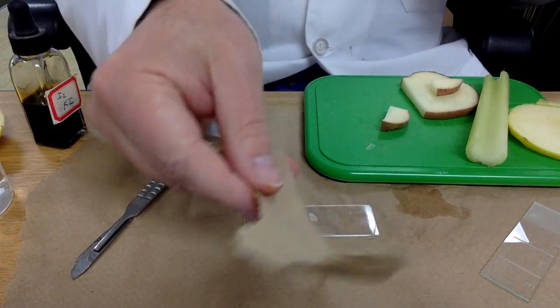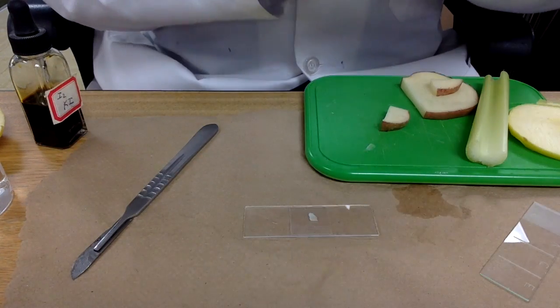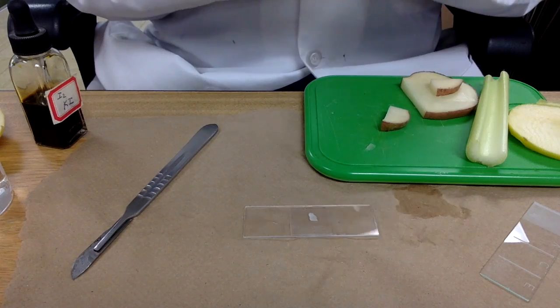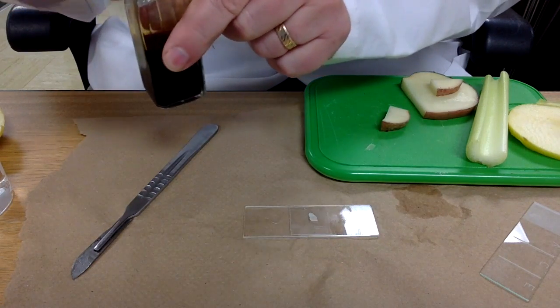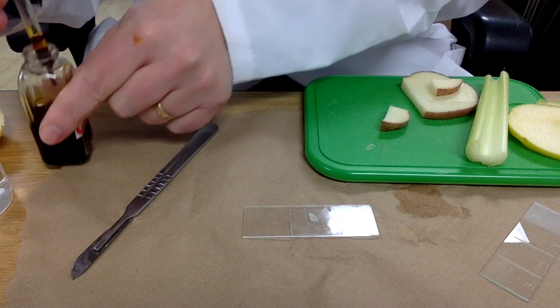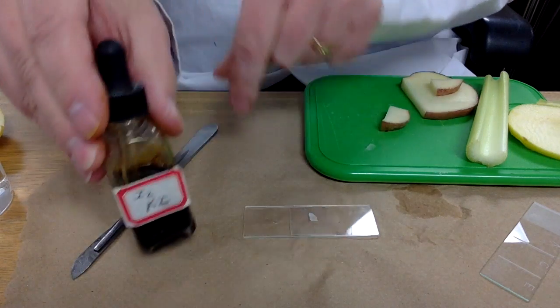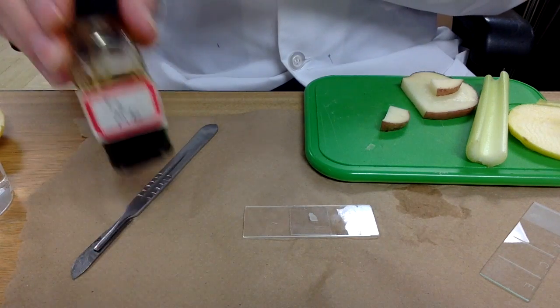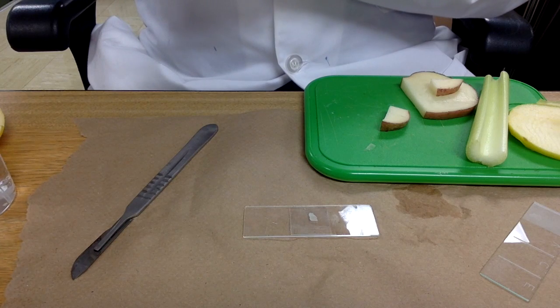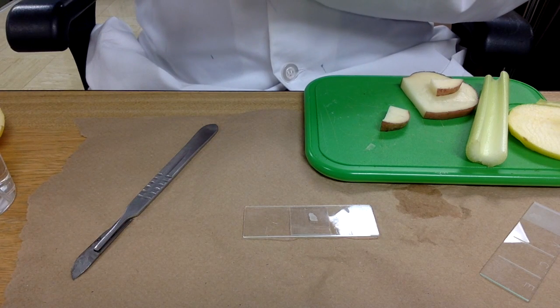This is kind of fun. You get yourself some paper towel. Take the eyedropper with Lugol's stain. You make sure you place that somewhere you're unlikely to spill it.